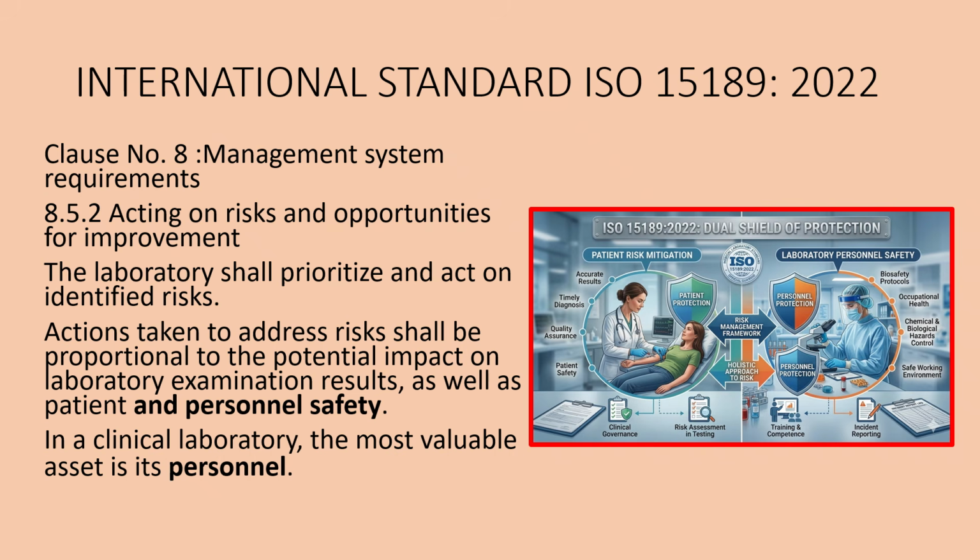While the primary focus of ISO 15189 is patient safety, the standard explicitly recognizes that a laboratory cannot produce high-quality, reliable results if the environment is hazardous to the people performing the work. Let's now look at the figure entitled Dual Shield of Protection.